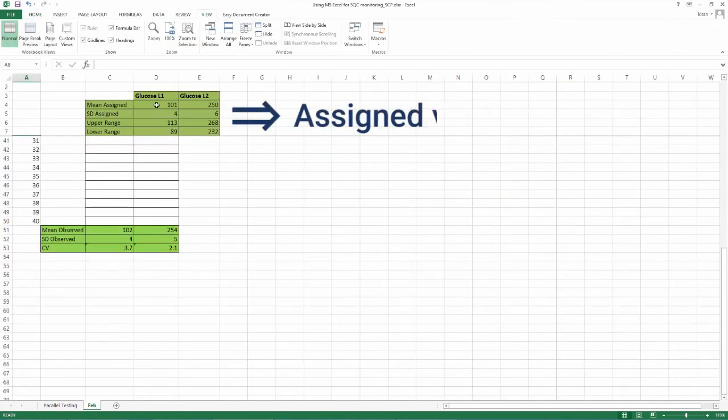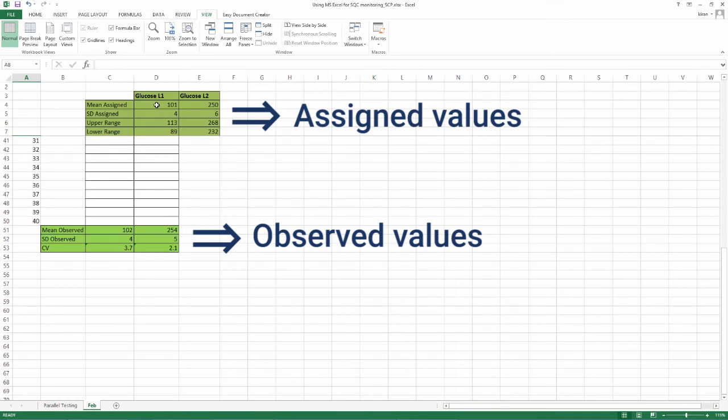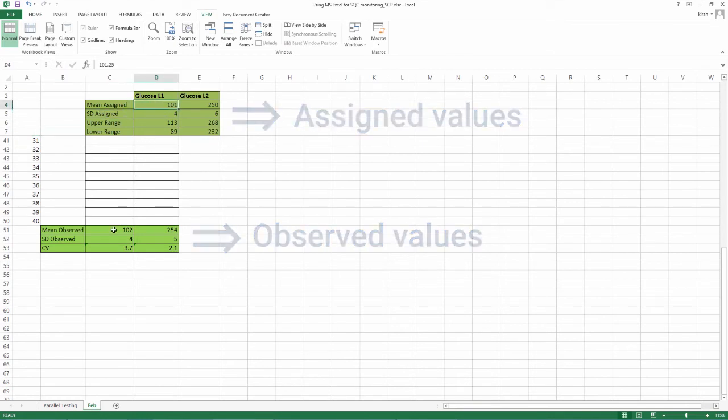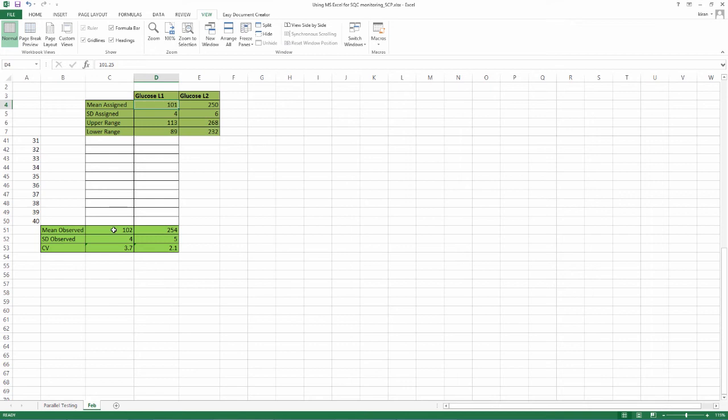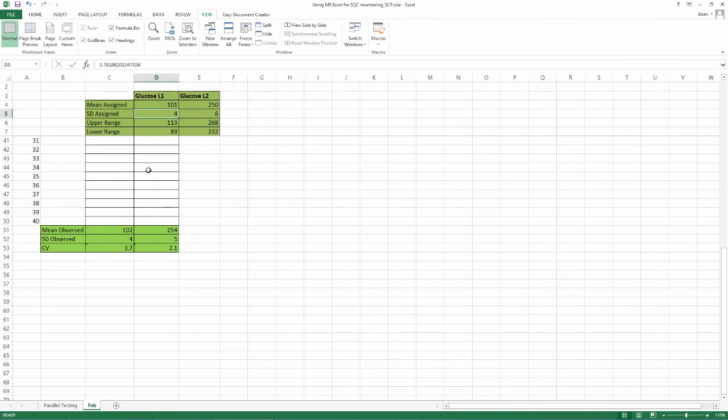Now, go to the bottom of the rows and look at your observed mean and observed SD. The assigned mean for L1 is 101 and the observed mean is 102. Assigned SD is 4 and observed is also 4.